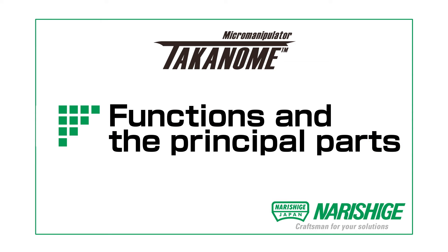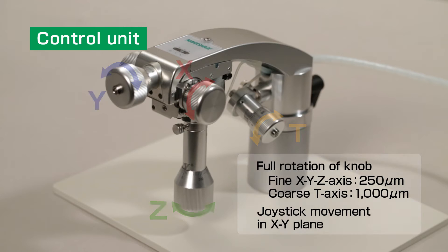These are the names and functions of the principal parts. Each of the X, Y, and Z-axis knobs provides movement of 250 microns per rotation.